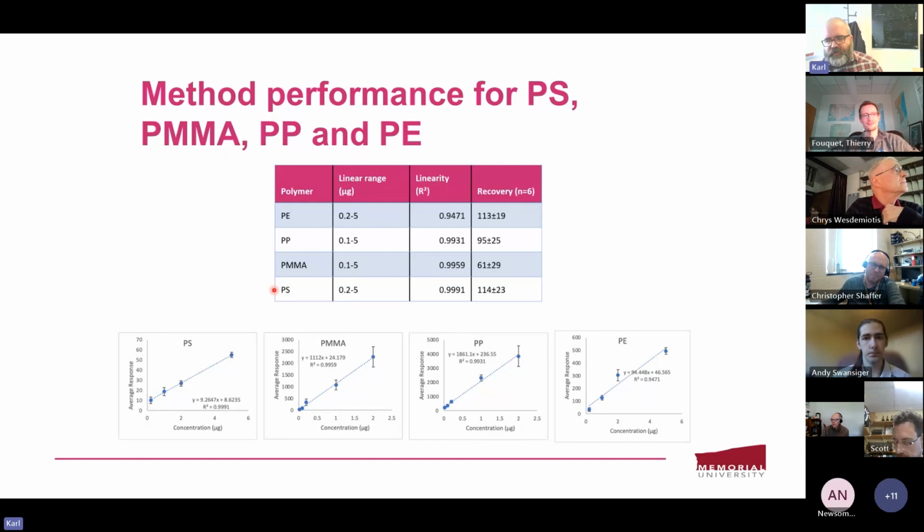I agree with you that polyethylene is by far the most abundant and mass-produced polymer, so one would expect to see that. Certainly in the marine environment, it floats and tends to dominate those analyses. So I'm not sure how to answer your question, other than we're not sure either why we're seeing this.